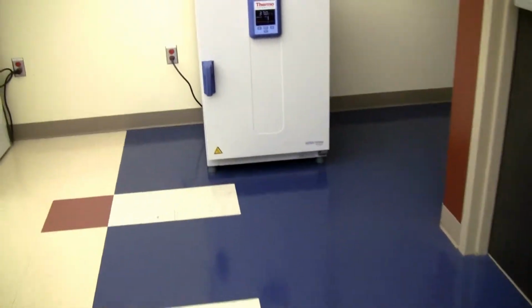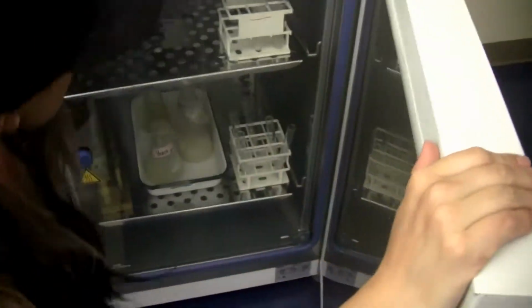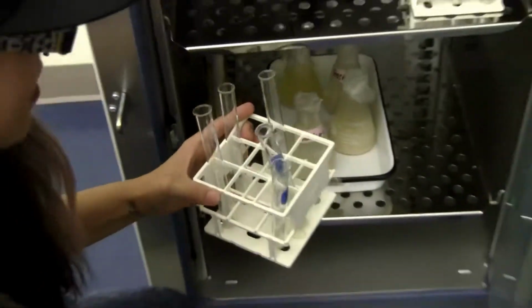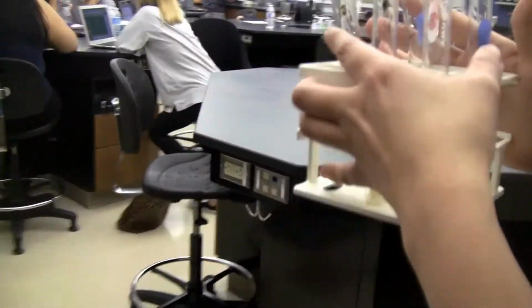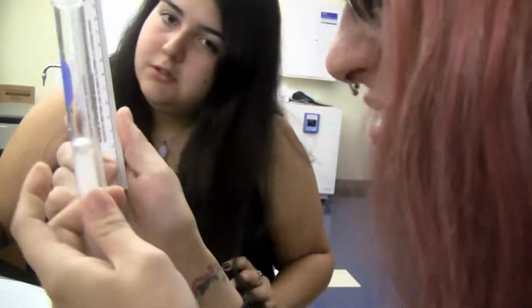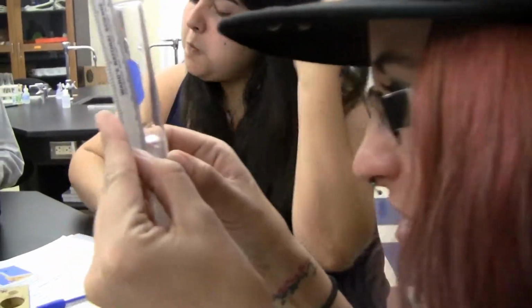We are now going to get our tubes from the Thermo Scientific incubator. Which one's ours? That one, on the bottom. It smells good in here. It smells like bread. Dang it. It's making me hungry. Okay. Ooh, there's bubbles. Where's the little ruler? So this is the glucose one, right? Do you need somebody to hold it? You got it.